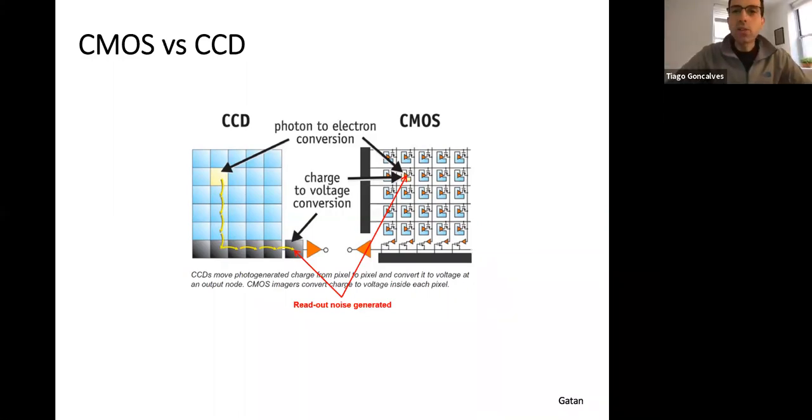Yeah. This is a relatively minor point, not something you'll need to know on an everyday basis, but basically in a CCD, because you only have one readout, you need to shift whatever charge you've accumulated from your exposure. So let's say you have 10 photoelectrons in this bucket, in this pixel. You need to move these 10 photoelectrons in a line, all this charge in single file, to be read out at the same amplifier and the same analog to digital converter. And that's what I mean.